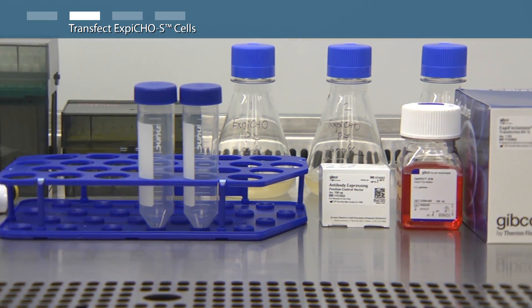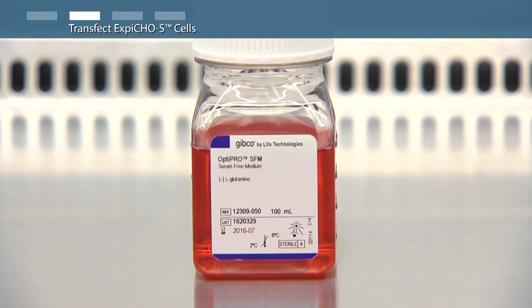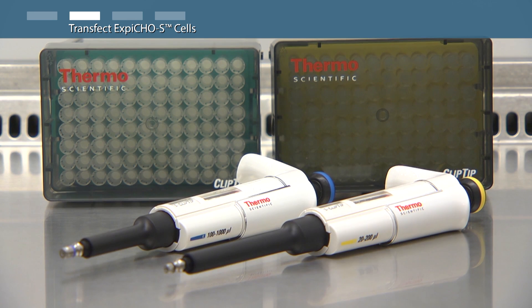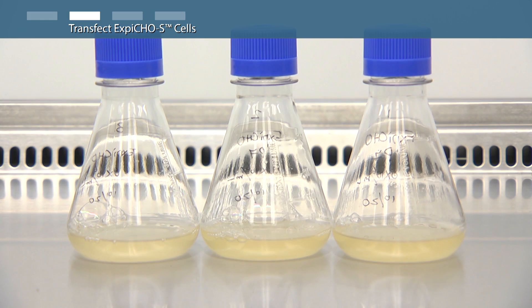For this expression run you will need: the ExpiFectamine CHO transfection kit, OptiPro serum-free medium, positive control DNA at 1 microgram per milliliter stock concentration, two 50 milliliter conical tubes in a rack, a P200 and P1000 pipette with appropriate tips, a pipette aid device with appropriate serological pipettes, a marker and a timer, and three 250 milliliter shake flasks with ExpiCHO-S cells at a density of 6 million viable cells per milliliter in a 50 milliliter volume.